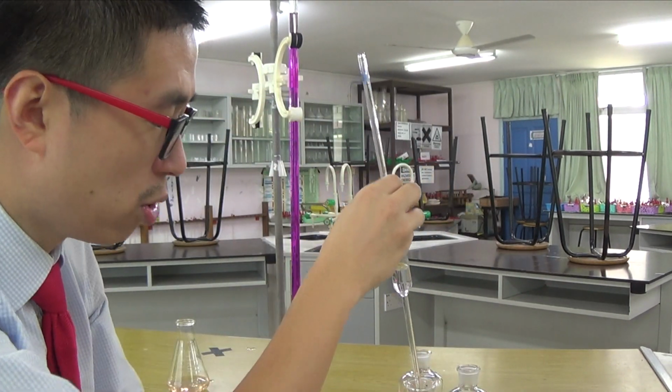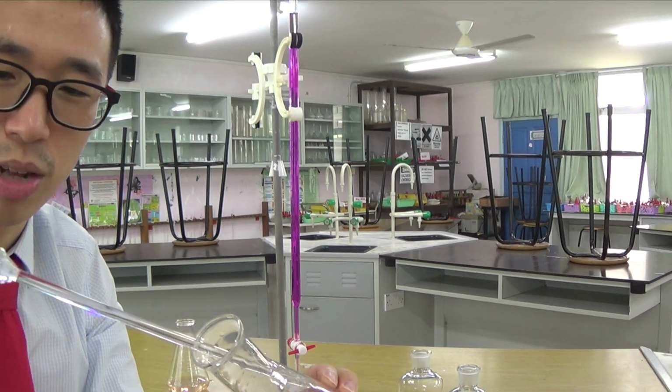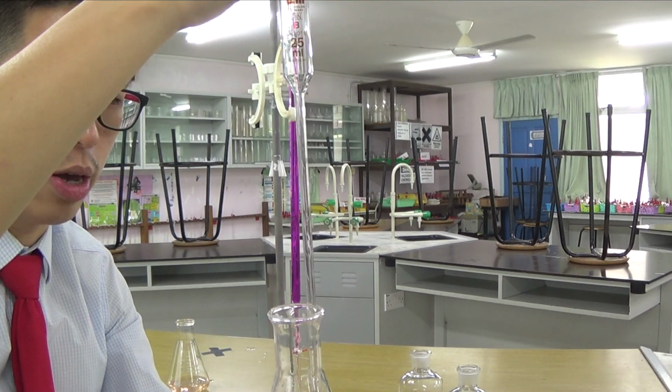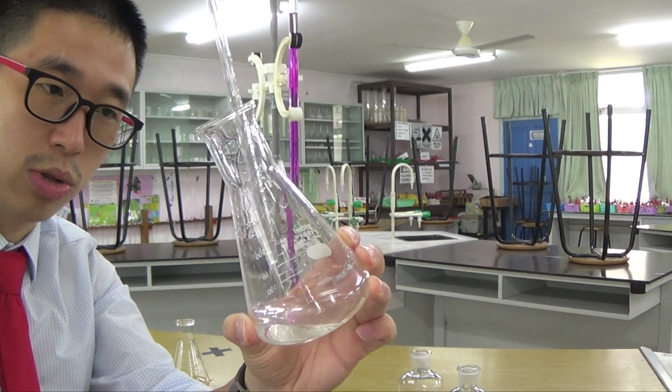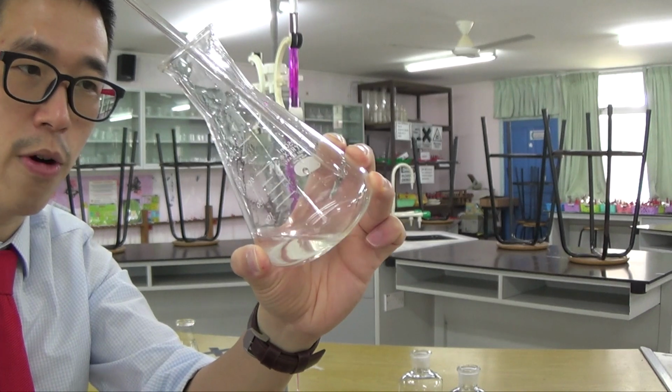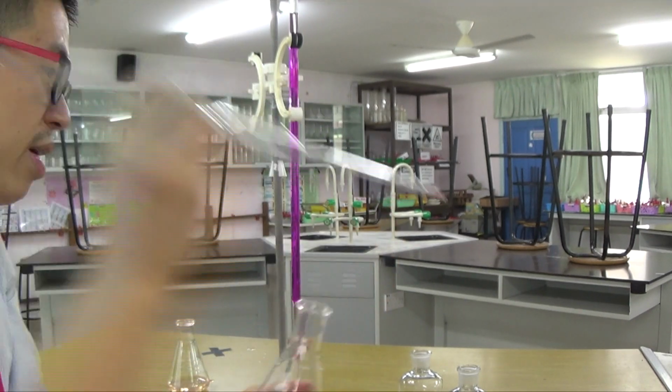Should have been a bit gentler, okay? So always be gentle with glass. Let gravity do its job, and when you reach the very end, only then you do the tapping. So let gravity do its job first. 1, 2, 3, 4, 5, 6, 7, okay.